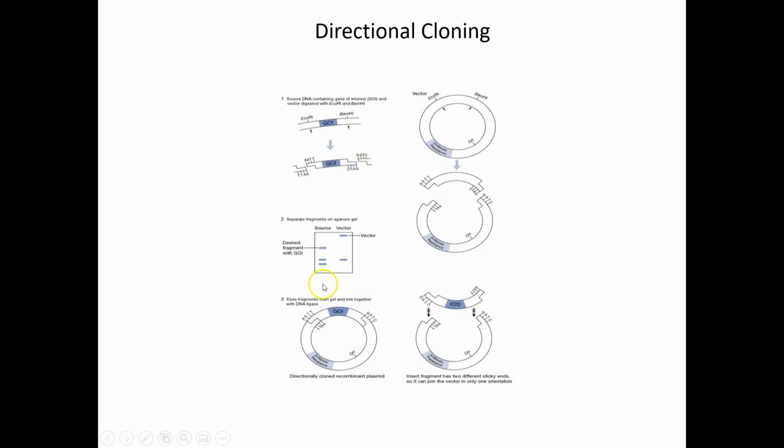And we can also reintroduce the idea of agarose gel electrophoresis here, because you can see that if we're cutting our gene of interest, we're also going to have these little scraps of DNA left behind that we're not interested in. And if we're going to cut away this middle region of our plasmid, we are going to have a little bit of a scrap region there. So we isolate the DNA that we wish to clone based on its size by running a gel, and then we physically extract the DNA out of the gel, isolate that DNA, and we can mix it together for a cloning reaction.